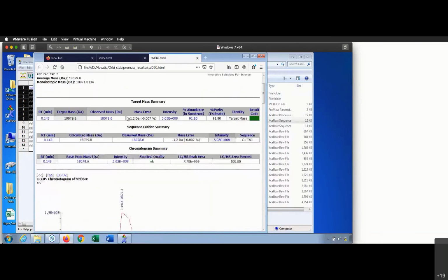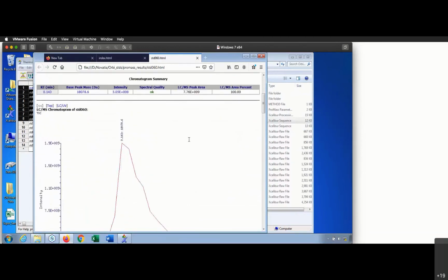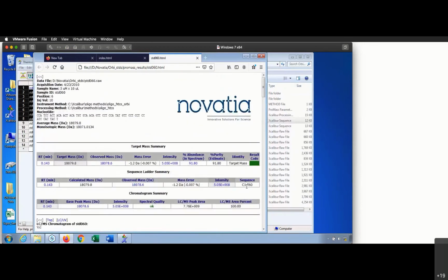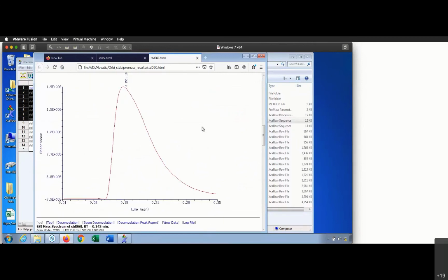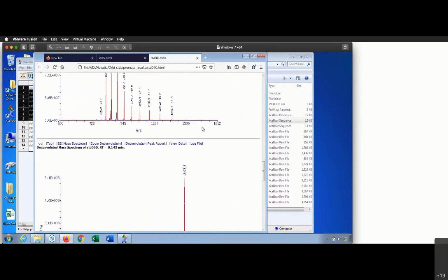I get all of this nice information just below that for the abundance, which in this case matches the purity perfectly because the LCMS area is 100%. There's just the one peak because we're running essentially a flow inject. It's just the high throughput method. And then it's got the full sequence listed out here because that's what we found, base C1 through T60. If I scroll down, I can see the TIC and the LCUV, and then I can show you the raw spectrum and the deconvoluted spectrum.